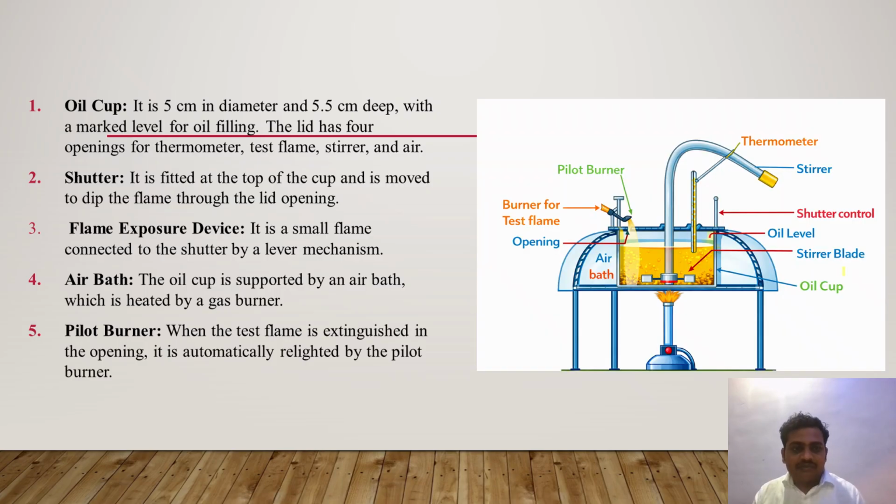If you observe this diagram, the oil cup is placed at the center. It is 5 centimeter in diameter, and it is around 5.5 centimeter in depth. So here in the central part, the oil is filled in this oil cup.